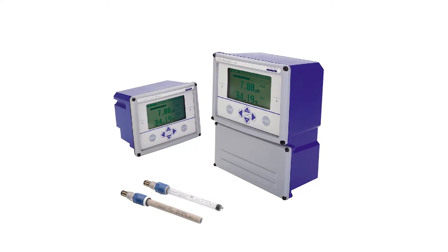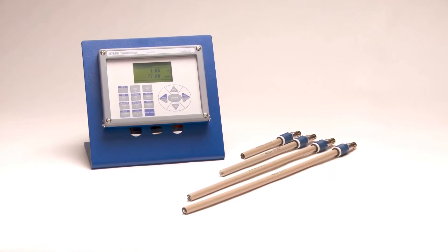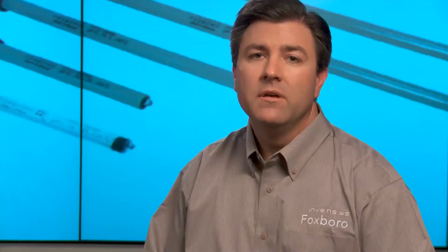Foxboro pH 12 sensors can be paired with the Foxboro 875 pH analyzer and the 876 pH transmitter for a complete pH and ORP monitoring system. It can also be used with most of our competitors' analyzers.